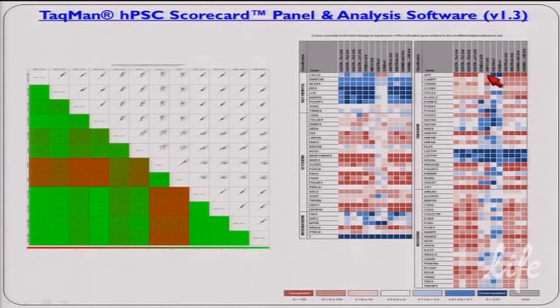This one line, which was iPS, it says 97I HD, and you can see that it's actually this one right here. It's blue. And we've confirmed this with multiple assays, and this was one of the lines that was further evaluated in Pluritest and also came out as not being able, so it had a bilineage potential and could not make endoderm. And so we were able to quantify that either it's something to do with a disease phenotype or it's a partially reprogrammed line. But all our other characteristics say that by flow cytometry and other gene expression studies that it expresses all the correct gene expression profiles for it to be pluripotent. So it's something probably inherent to the disease phenotype.